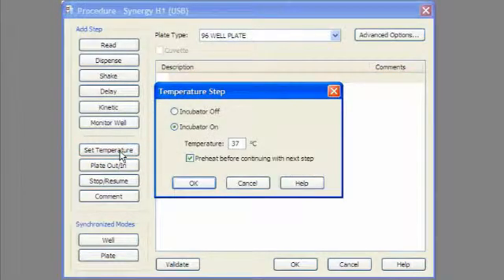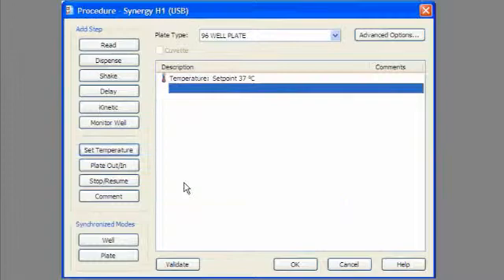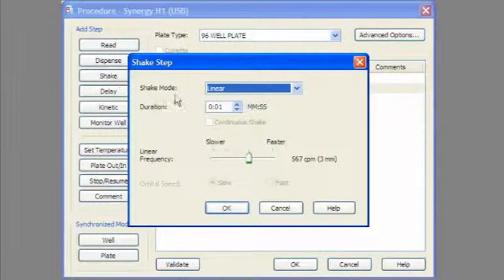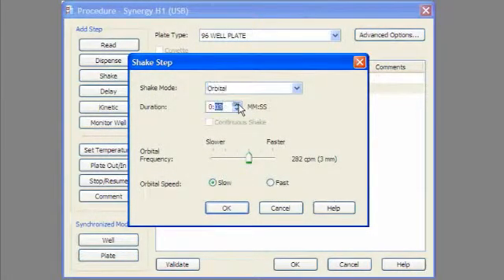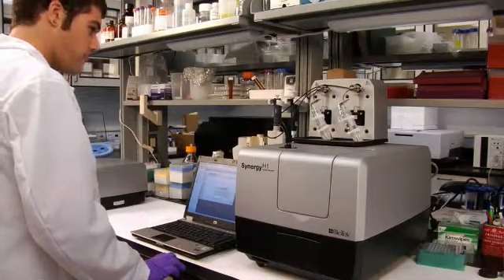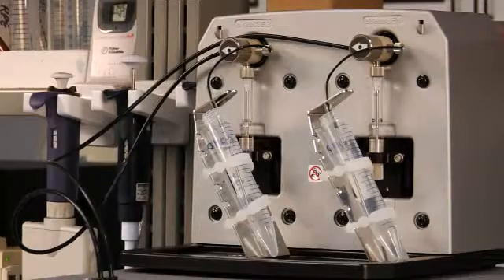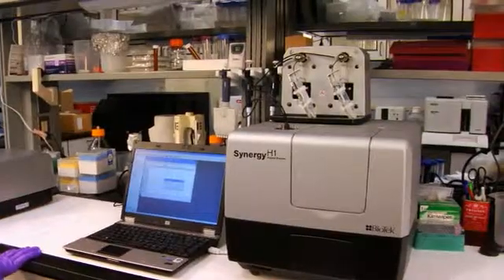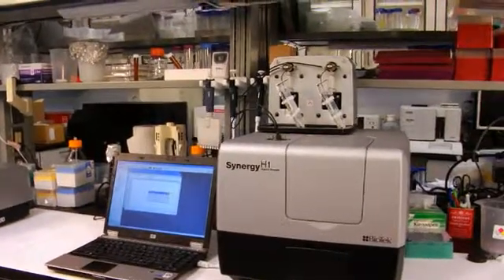Synergy H1 comes with a built-in temperature control system to 45 degrees Celsius as well as a plate shaking mechanism. An optional reagent injection module is available. This module is used to automate inject-and-read assays such as flash luminescent luciferase or fluorescent ion channel assays.